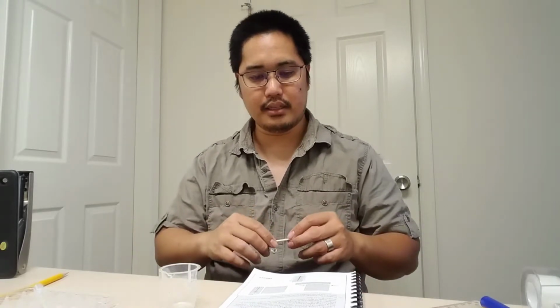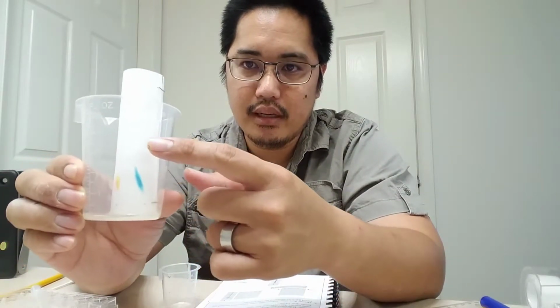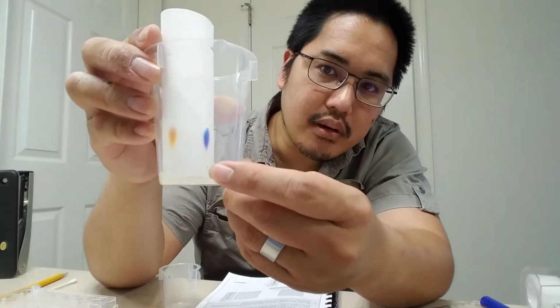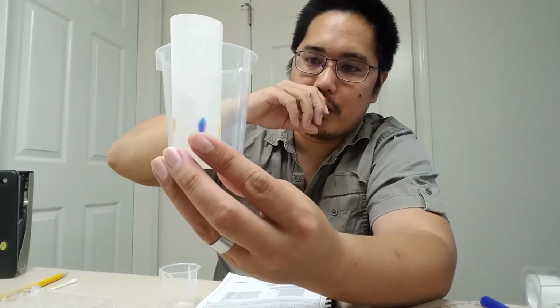Then what you want to do is measure the average distance that each solute has traveled and record that distance in millimeters in the table provided. Now, you might see the dots stay there and then move completely, or you might see the dots just streak all the way up, depending on what you use, of course. Now it looks like all of these dots started off at that small dot right there, but then they're starting to move up as this thing uses its capillary action to pull that water up the streak.